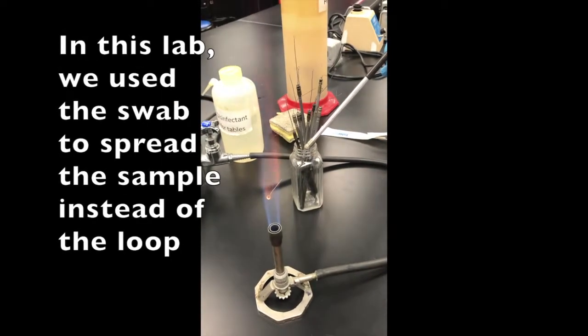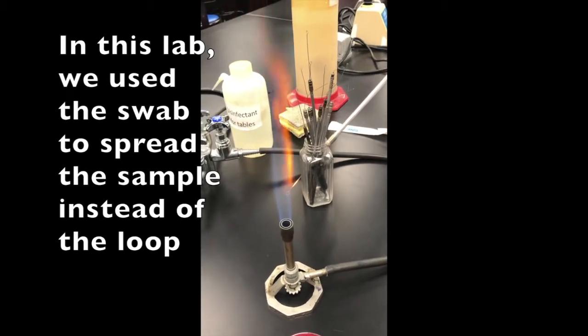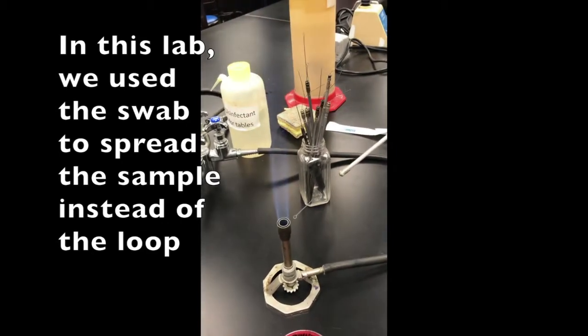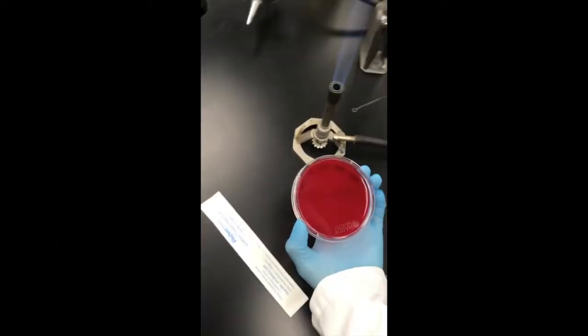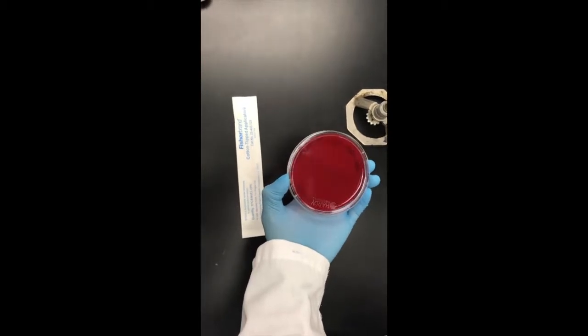So the reason why you want to streak with a loop after the swab is because some people will have more bacteria and some will have less. So if you have more, you're going to end up with a huge lawn of bacteria versus maybe some isolated colonies.